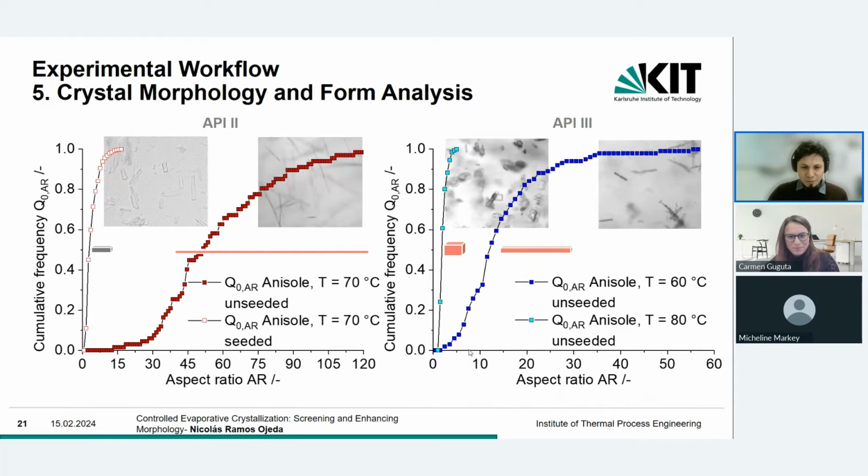So if we perform some temperature program going above a certain temperature, then we can crystallize a polymorph that we don't want to have. So by doing evaporative crystallization, we had a new degree of freedom to keep the temperature constant, and exactly at that temperature oversaturate the solution.